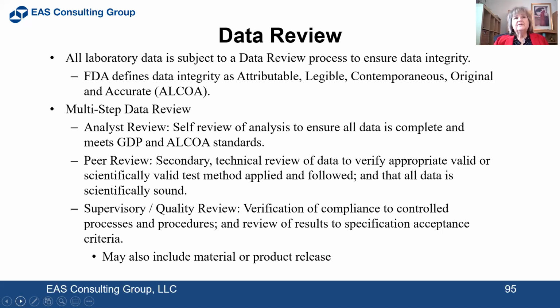Then you should have a peer review, a secondary technical review of data to verify a scientifically valid test method is applied and followed, and that all data is scientifically sound. Then you're going to have a supervisory or a quality review, which is a verification of compliance to controlled processes and procedures and review of results to specification acceptance criteria. It may also include material or product release by your supervisor.